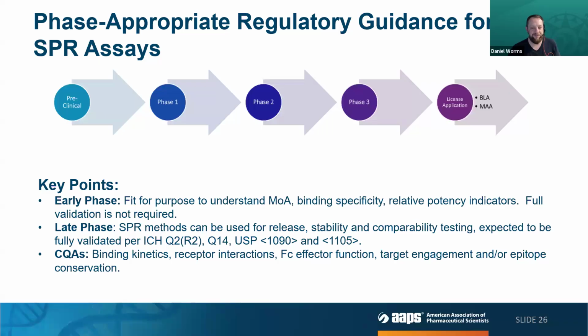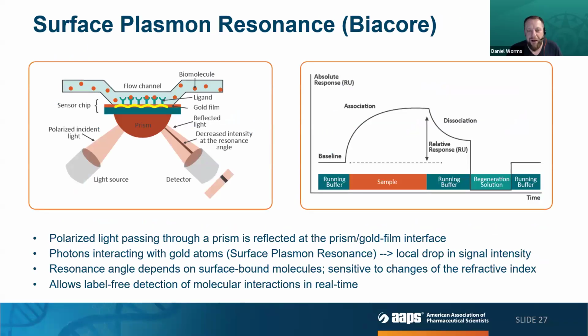Next slide, please. All right. Before we go into some experimental details, I would like to give you a brief introduction into the technical background on SPR, or surface plasmon resonance. In full, we are using Biacore devices for SPR analysis.